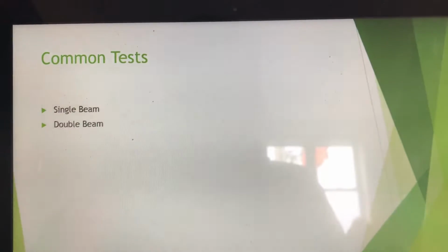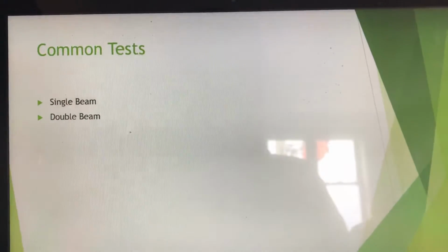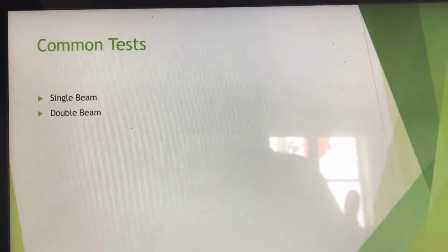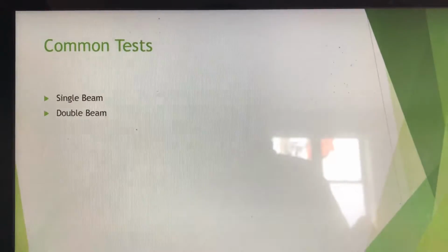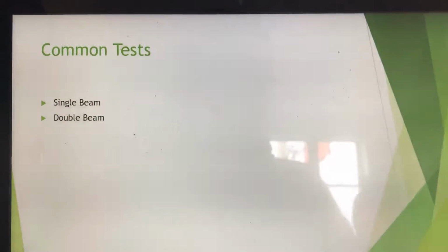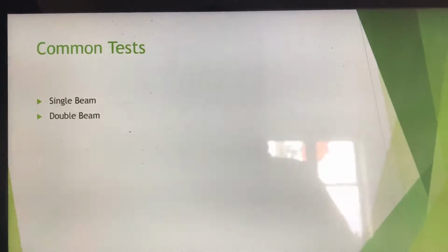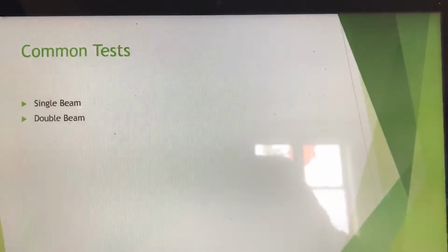with double beam you have your source light that is shot at a beam splitter, and one of those beams is going to go up towards a fixed mirror and then reflect, while another one is going to be shot through at an oscillating mirror, and then those will go down to your sample, which has the detector behind it, and then you'll get your graph that you need.